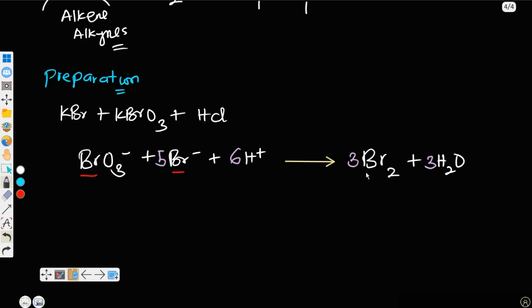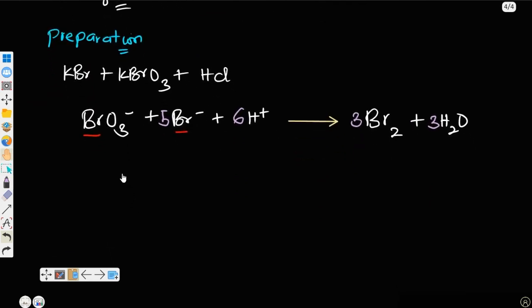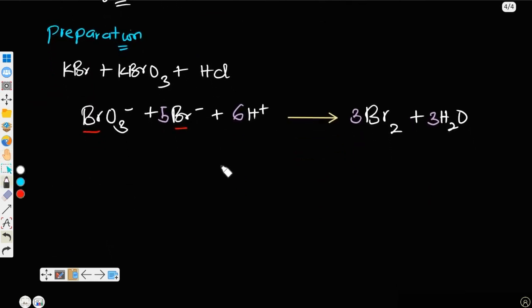Now let us assume you need 2 molecules of bromine, as in the assay of isoniazid. Now, what do you think the equation of reaction would be like? The equation of reaction, that one now you need 2 molecules. I'm just talking about another practical generally. So that one now will be, we are still using our BrO3 minus. That is one thing I want you to understand, that the amount of bromine that you need will determine the reaction you are going to write.